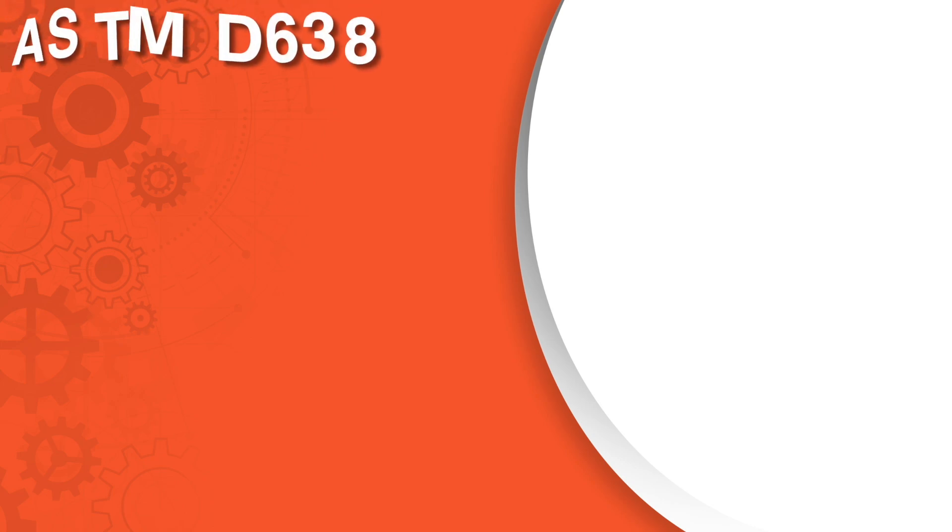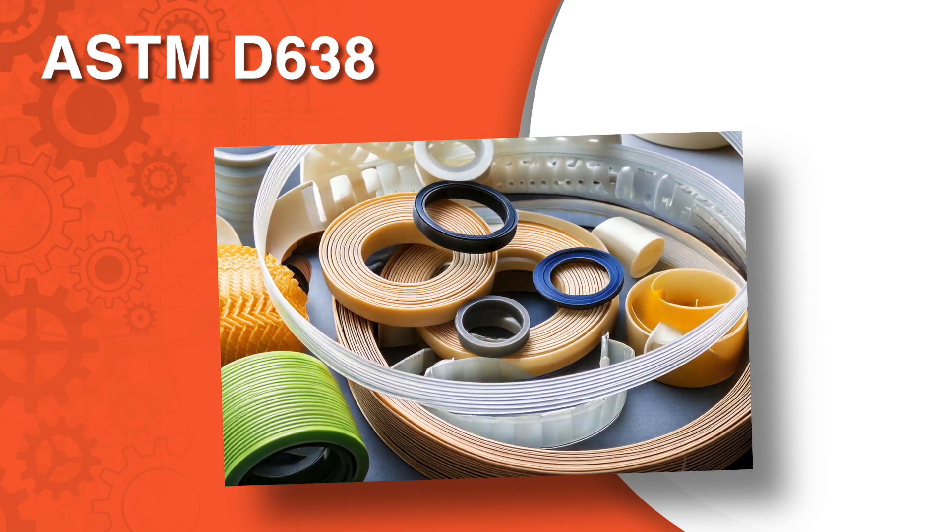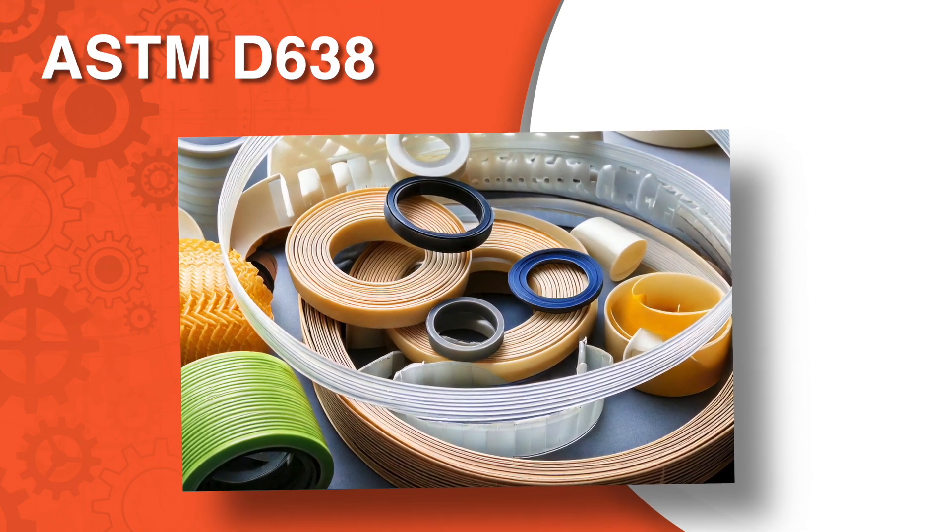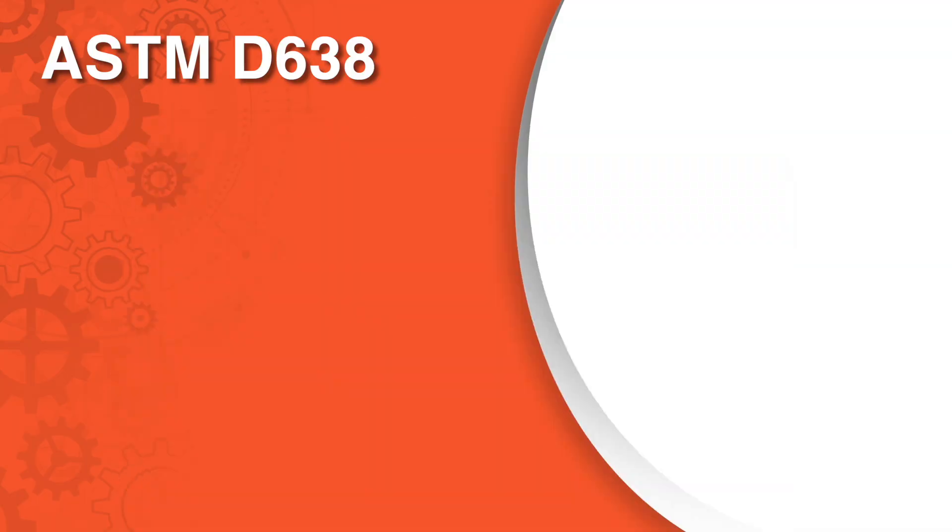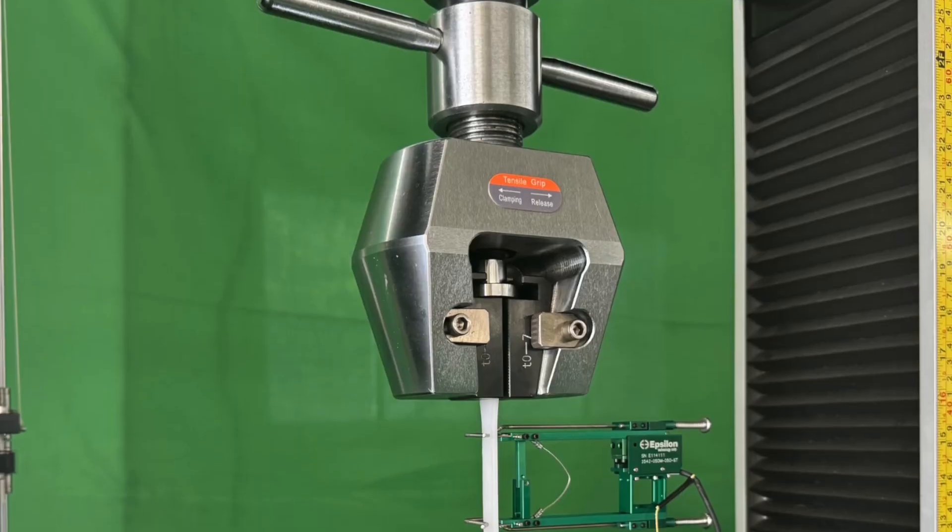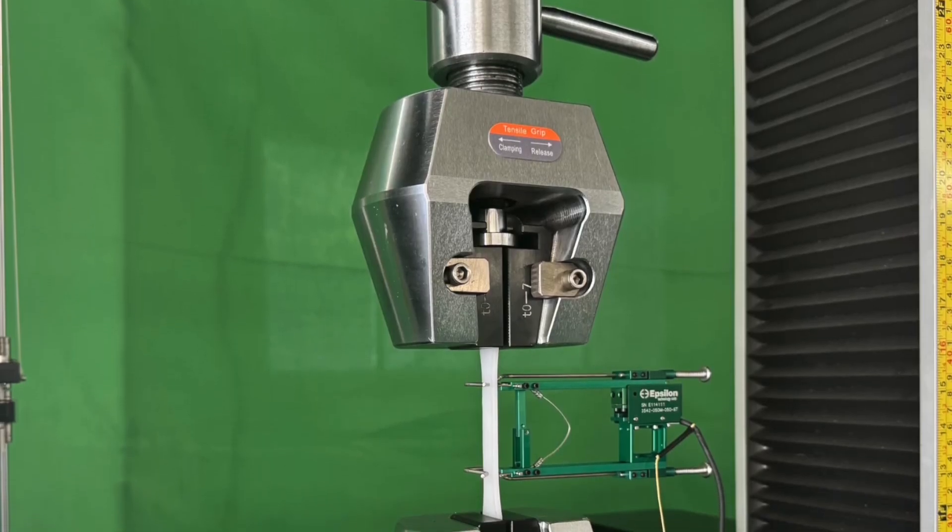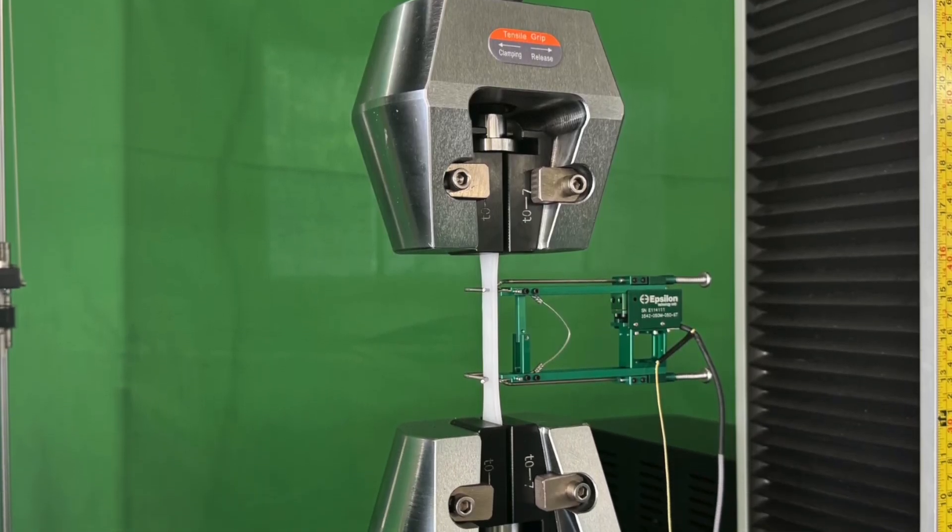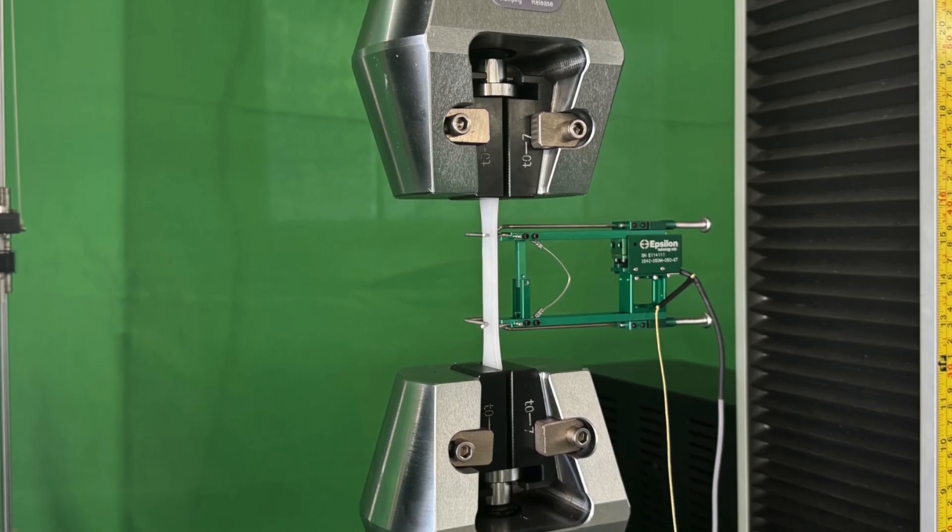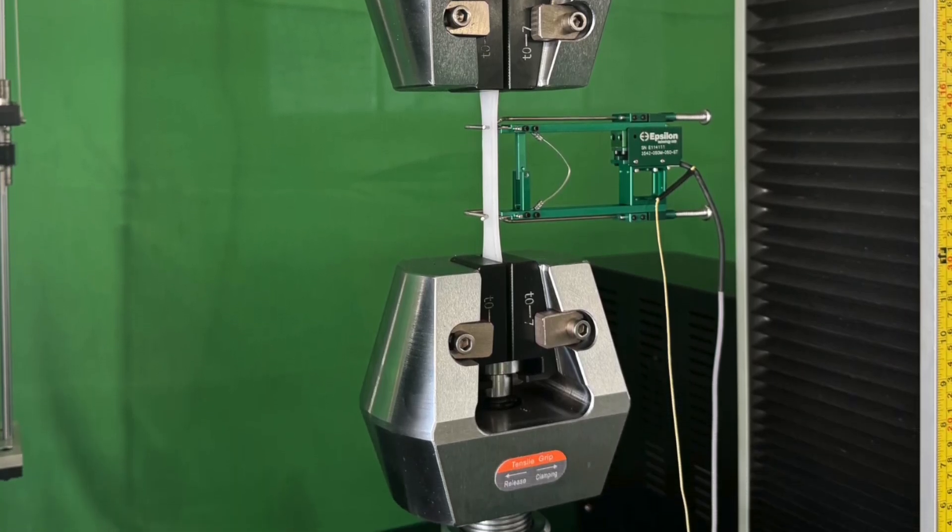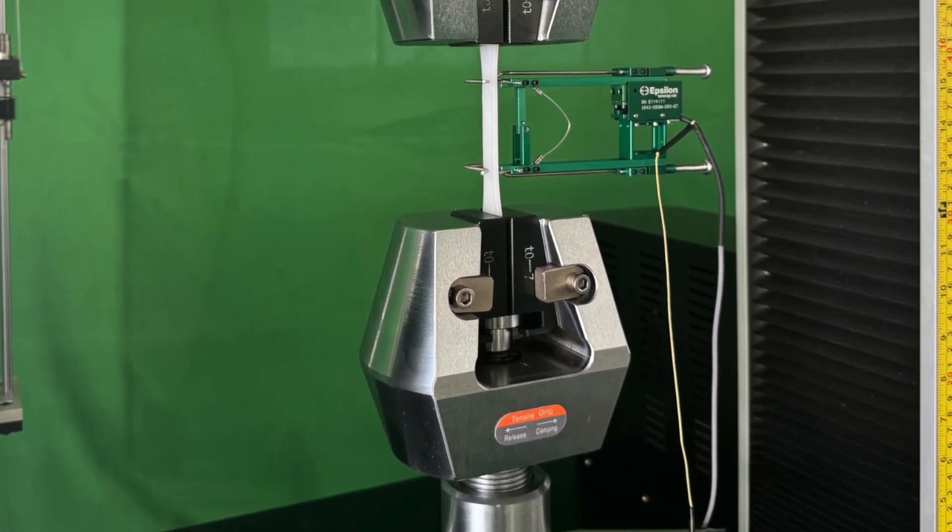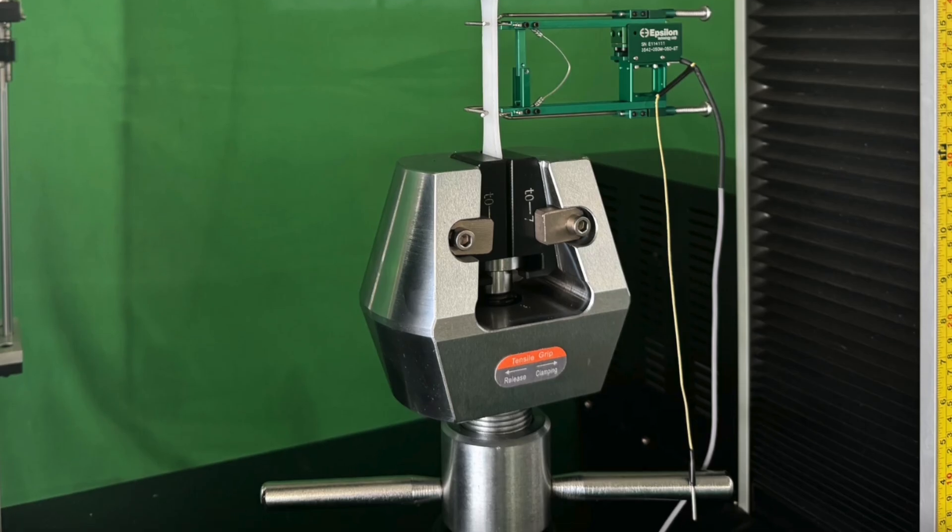ASTM D638 is a widely recognized standard for evaluating the tensile properties of plastic materials. It measures tensile strength, which is the maximum stress a material can withstand while being stretched, and elongation at break, which indicates how much the material stretches before breaking.